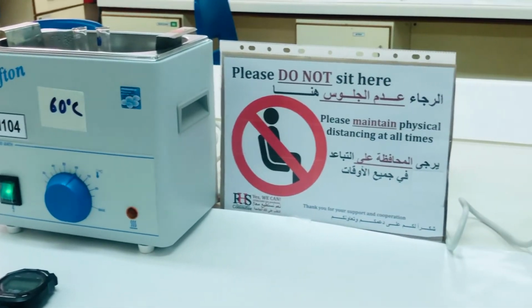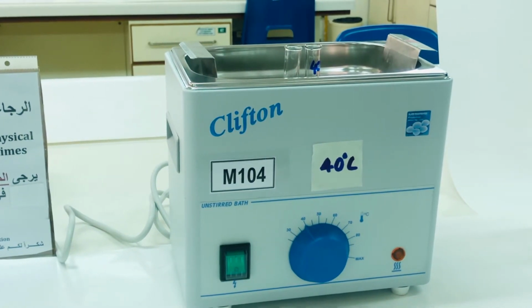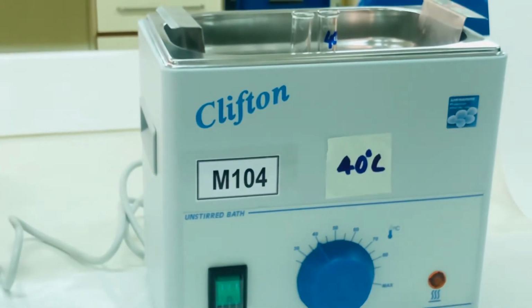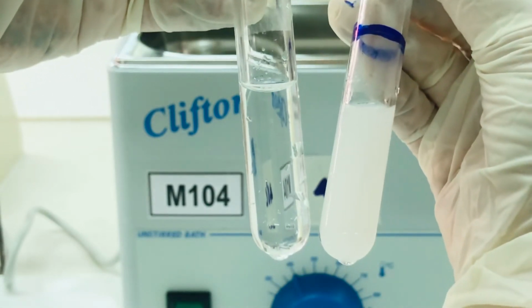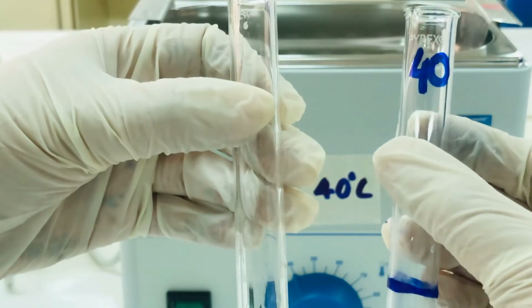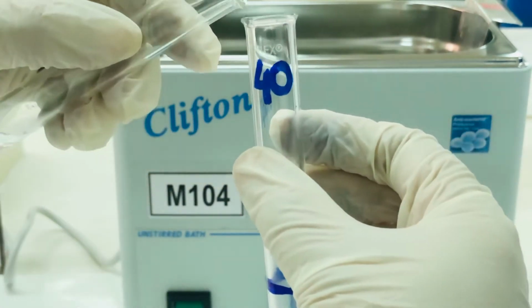After 5 minutes, we will take out these test tubes and add trypsin to the milk sample. After 5 minutes, take out the 2 test tubes. You can see the milk sample and the trypsin both have attained a temperature of 40 degree, and now we are going to mix the trypsin sample in the milk.